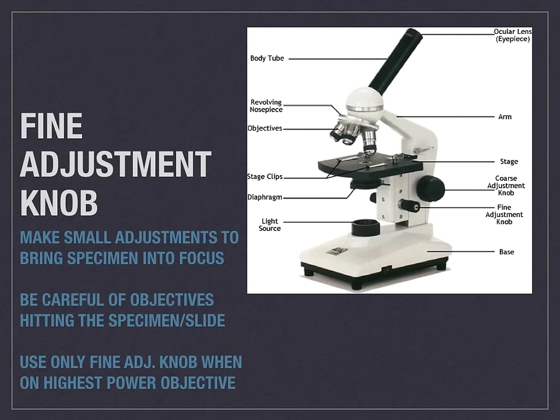The fine adjustment knob is located just forward of the coarse adjustment knob in this picture. It is usually the smaller of the two adjustment knobs. This will make much smaller adjustments to the stage and will ensure that you bring your item into focus as you potentially would adjust, or after adjusting, one of the objectives.